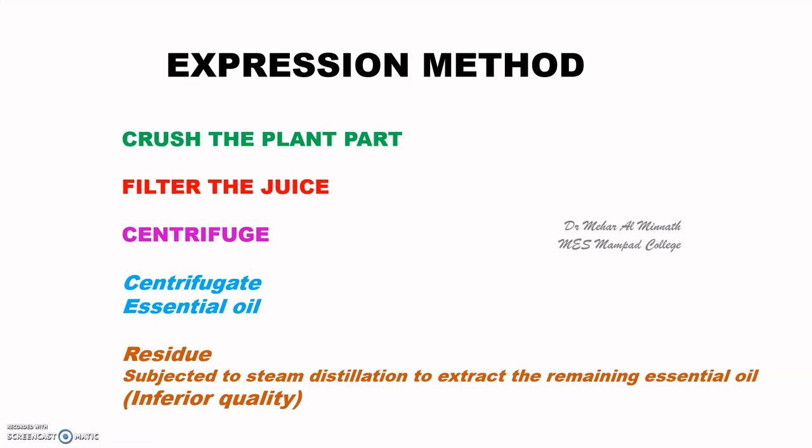Now this particular method is used particularly to extract heat sensitive essential oils, because here you are not supplying any heat. This is also called cold pressing. So citrus terpenoids like limonene, etc., or citrus essential oils can be extracted by this method.